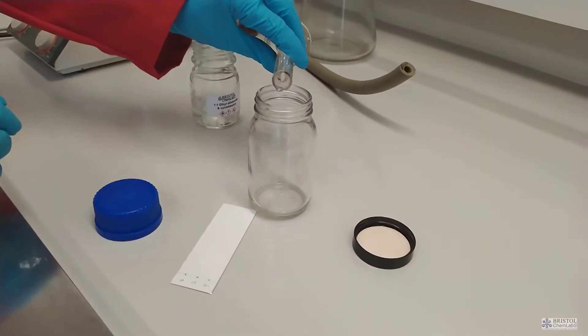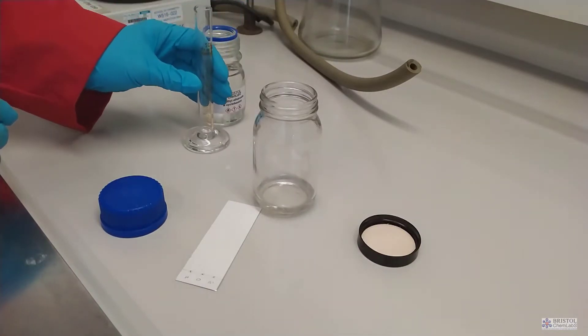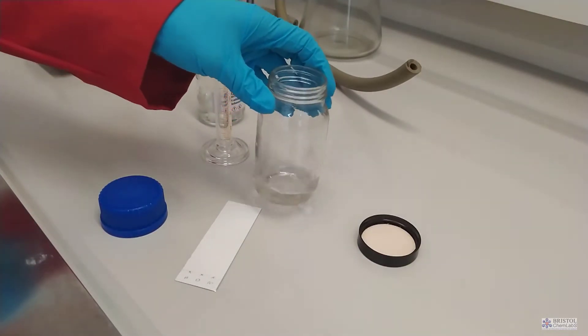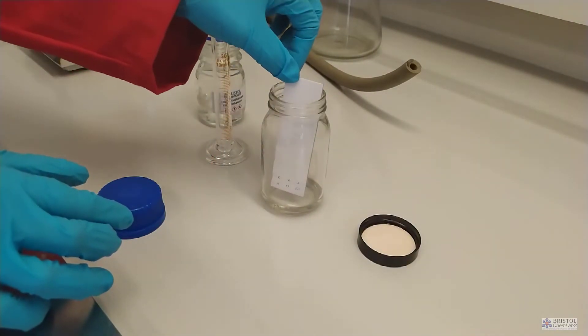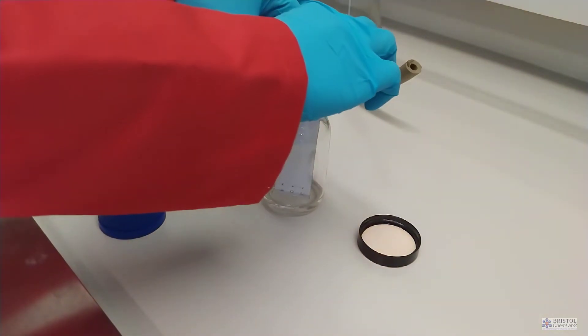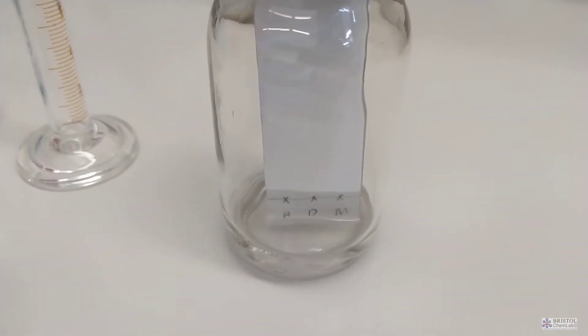After a while the solvent mixture passes up through the alumina of the TLC plate and depending on the intermolecular bonding of your samples it will progress up the plate at different rates. And we stop the TLC before the solvent front gets to the top of the plate.